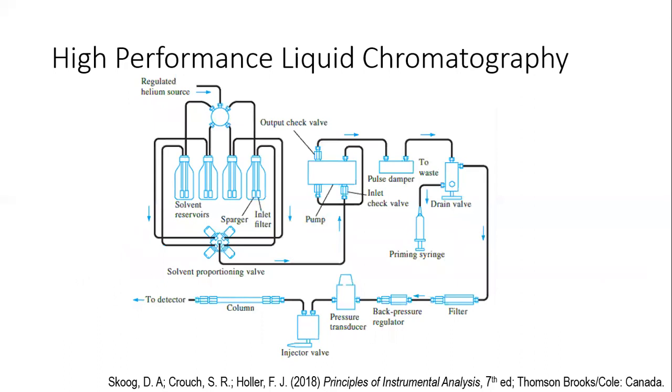So this is a diagram for a typical HPLC. You have here your mobile phase, yung mga solvents. Then you have a pump, which controls how much of a particular solvent or mixture of solvents is used. You have here your sample injection port.